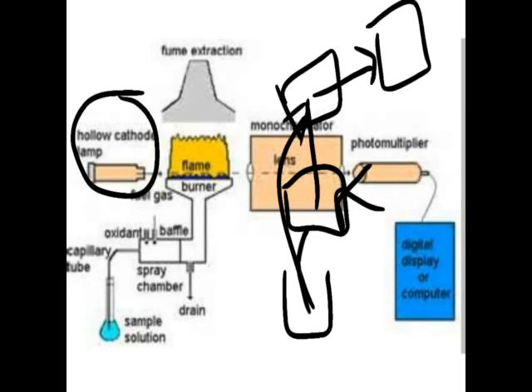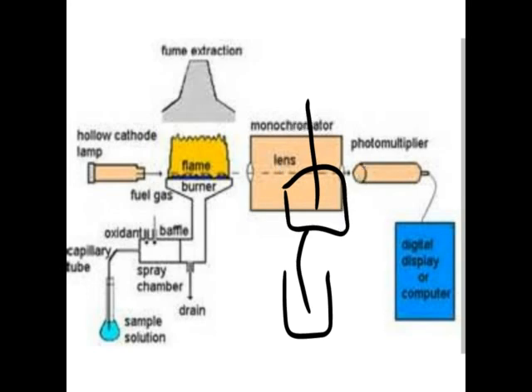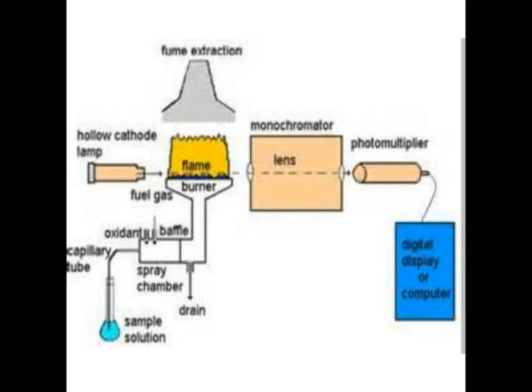That is the lamp, it is present. So you can see the instrumentation, there is nothing different from the flame.